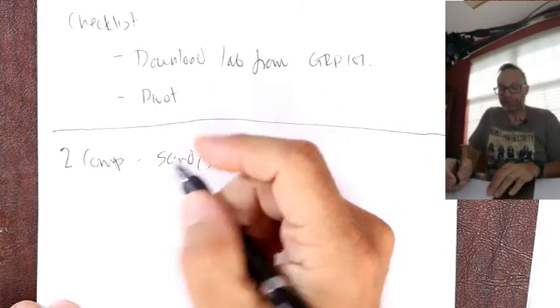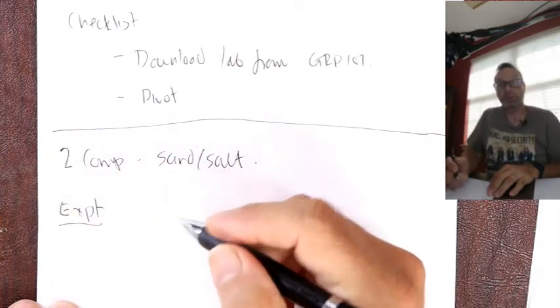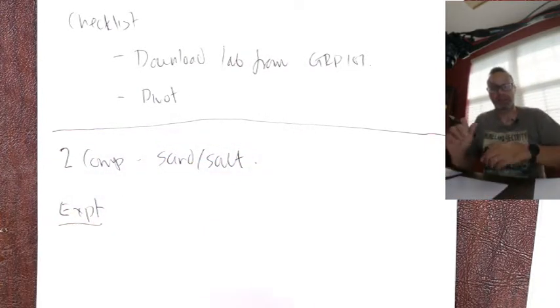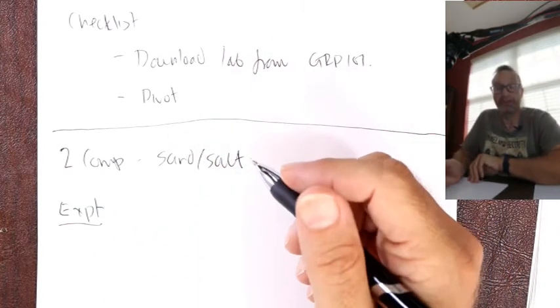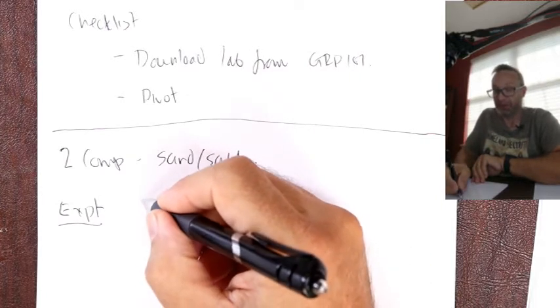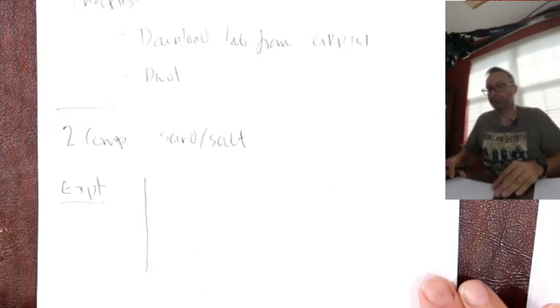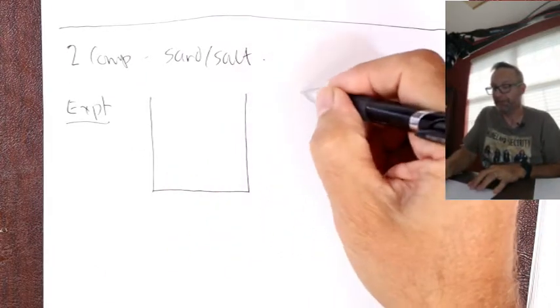So if we did the experiment, and should this be class, you'd be given literally a test tube with a sand-salt mixture in it, and of course an unknown label, right? What you always have to do is find the mass of the mixture, okay? So what we do, let me move this up. We weigh a beaker, okay?